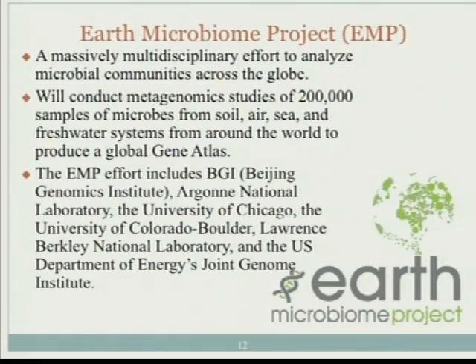So they will do like 200,000 samples of microbial organisms from soil, air, sea, and freshwater systems. So they don't do human or other animal-related samples. But I think most of them will really be from soil. And I think they have already collected a lot of samples. They will do both 16S and shotgun.